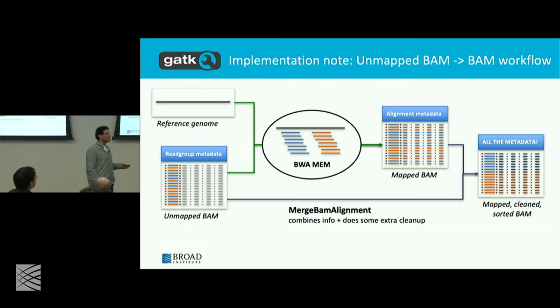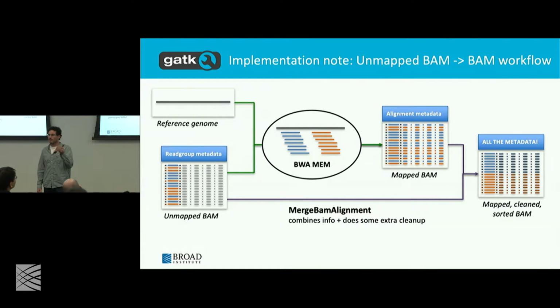It also does some extra cleanup. For example, those bacterial reads that Mark showed in the previous talk, MergeBamAlignment will identify them and unmap them for you. So it will clean it up a bit.